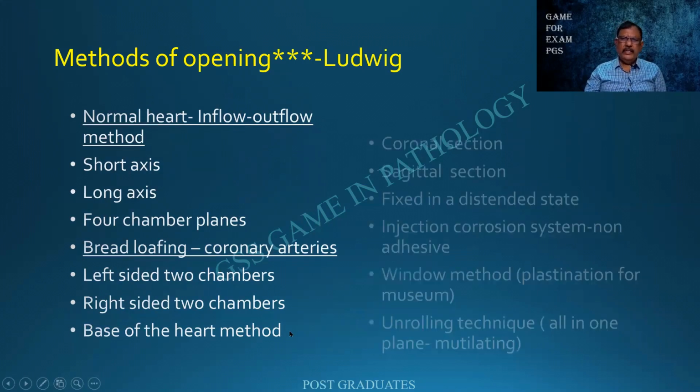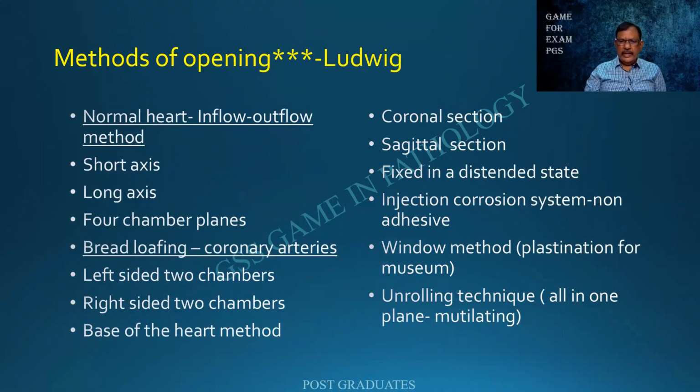If you are not happy with the list, see this also. So the entire list you people should be rattling off. And if your examiner asks, where did you read this from? You boldly say it is from Ludwig, Autopsy. And Ludwig himself says, in spite of this entire panel, these two things which I have underlined are logical. One is the inflow-outflow method described by Rudolf Virchow. And the second one is bread loafing for finding out any obstruction in the coronary artery. There are all the other methods which you people will have to learn by heart beyond my explanation.